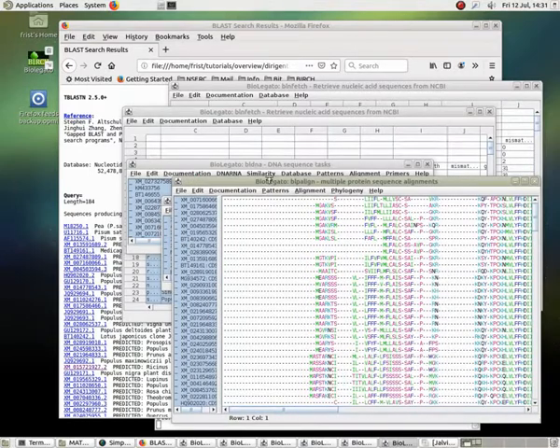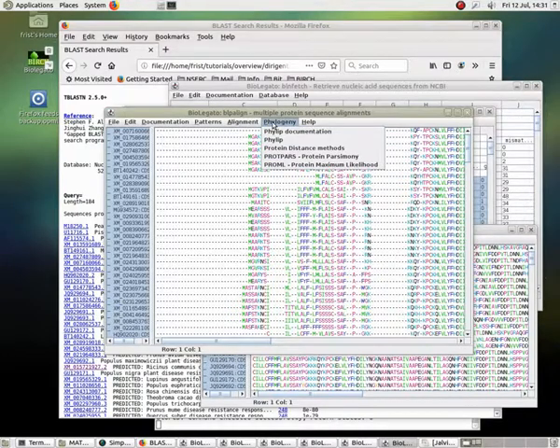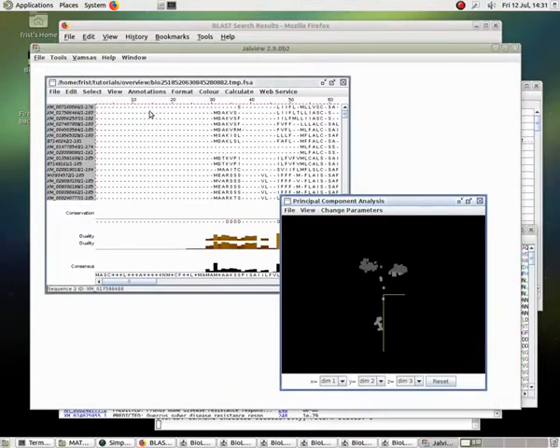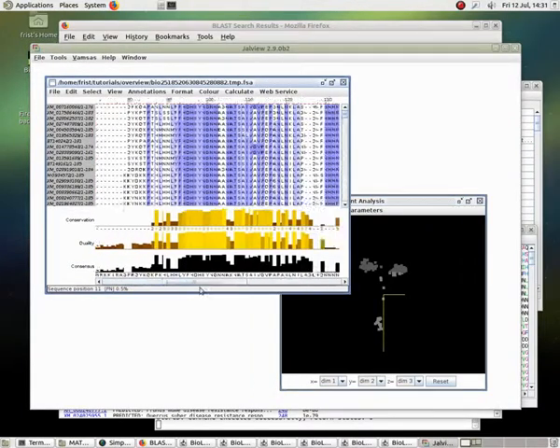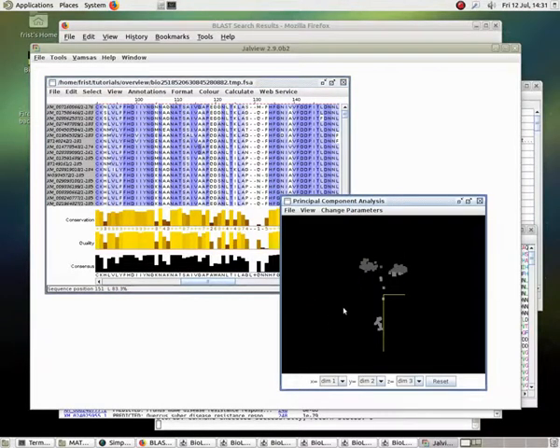So the protein alignment, there we see it in the BioLegato window, and I can either work with that, for example, make phylogenetic trees out of the alignment, or even send it to a program like JalView, where I can examine the alignment in more depth, looking for conserved regions, or how the sequences group using principal component analysis. And so the ad hoc pipelining lets us do many different things at each step before deciding what we want to do at the next step.